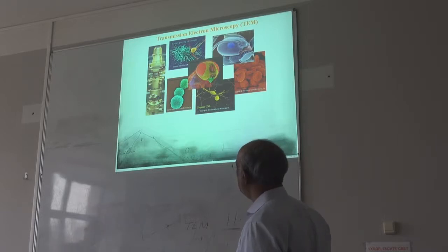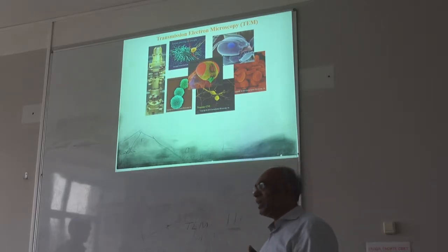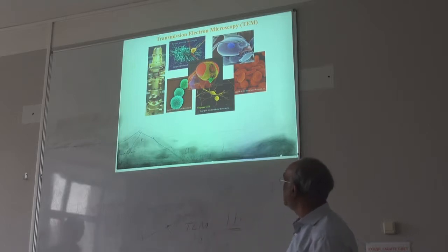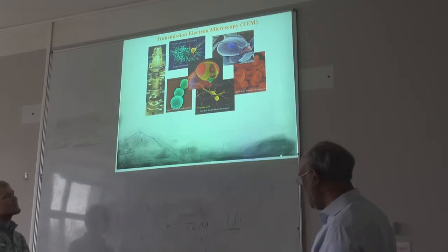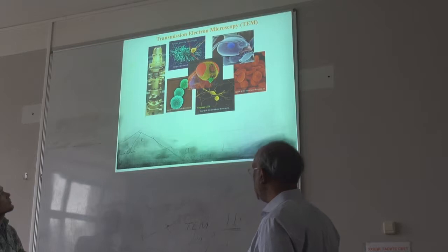Oh really? Okay. Basically what you have is the electron source, the sample, then everything is about lenses, right? To focus, but here the lenses are not optical lenses. They are electric fields and magnetic fields. You have magnets and some parallel plates to focus. Then basically you can create the image here. You can either view from here or project onto a screen, using a CCD camera.